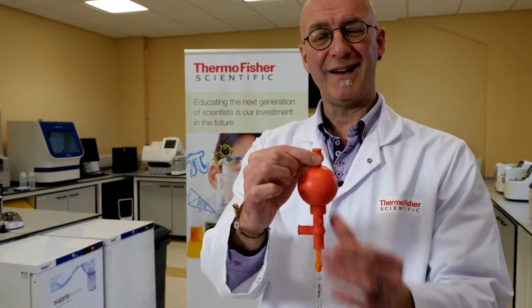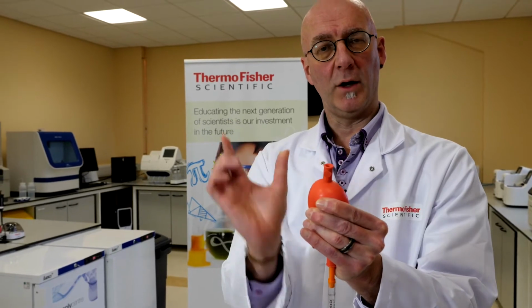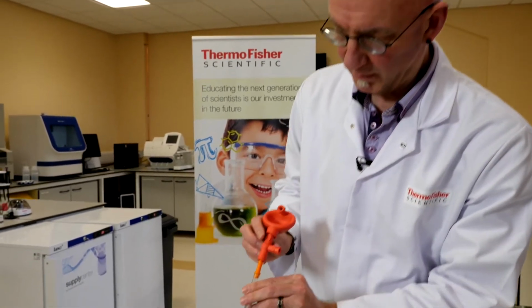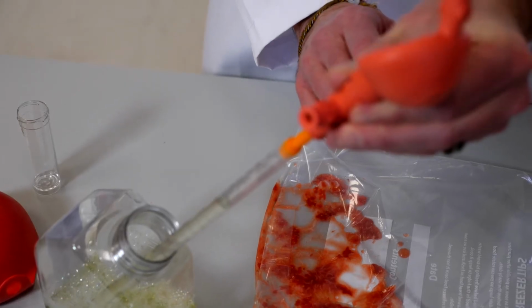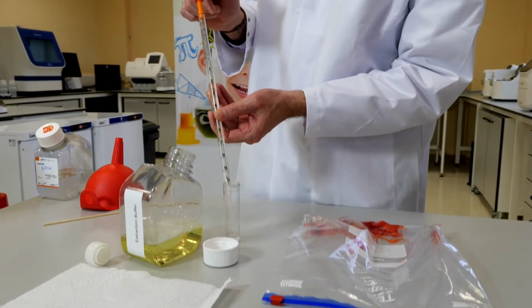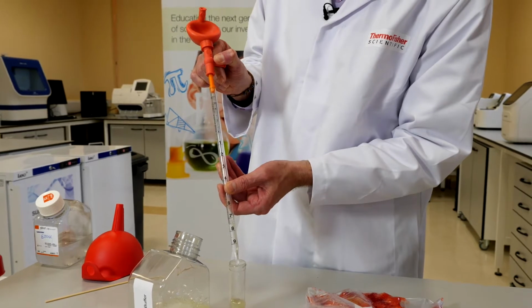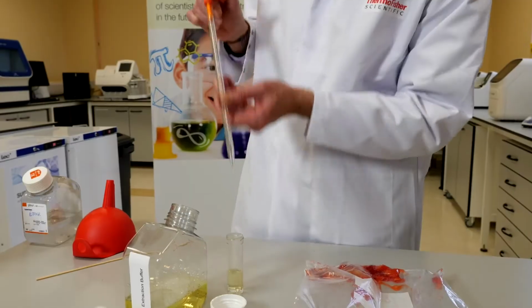First of all, we want to expel the air by pressing the top button and squeezing the bulb. Let go of the button and the air will remain expelled. This is what's going to suck the extraction buffer up into the pipette. So we put the pipette in, we now press the second button, and you'll see that the extraction buffer is sucked up. We're going to press the final button. If we press any of the other buttons, it will go disastrously wrong. So what we want to do is press that final button, and that allows the 10 mils of extraction buffer that we have sucked up into that pipette to be released into our tube.